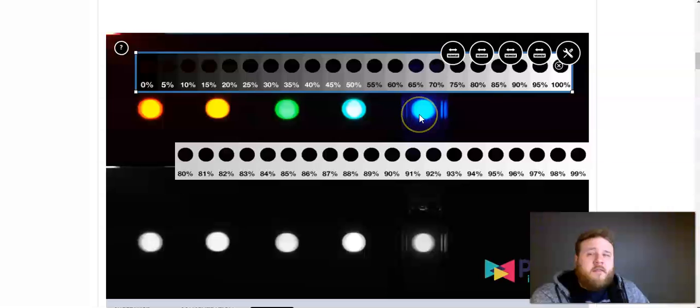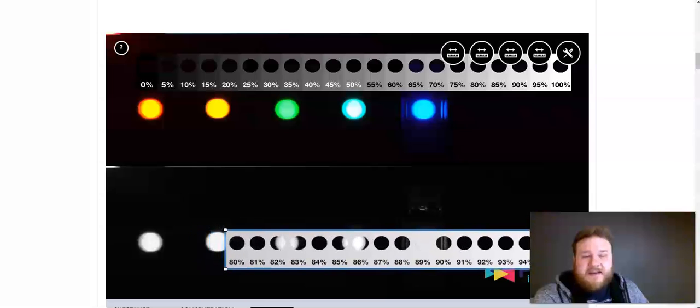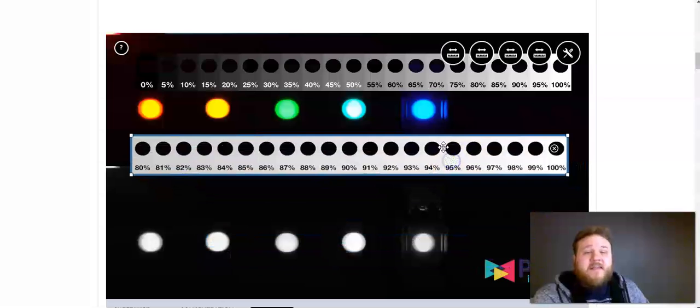So keep in mind, think about what I just put in there. I did the 0.4 molarity of the copper sulfate. The copper sulfate was a blue solution. But for the blue LED light, it has about a 90%, maybe 89% transmittance. That means 89% of the blue light is passing through the solution. That's the transmittance. That light is transmitting through the solution.